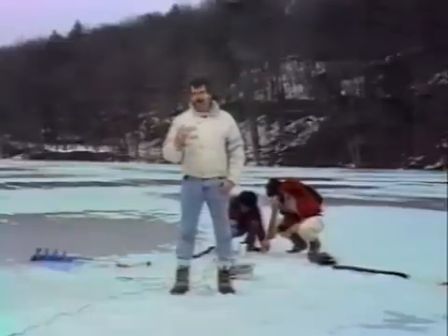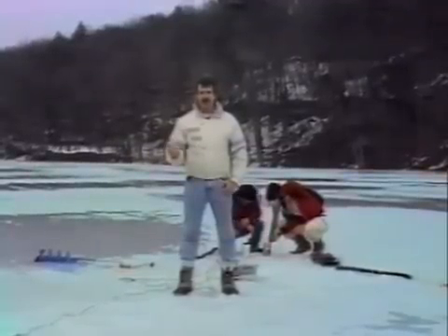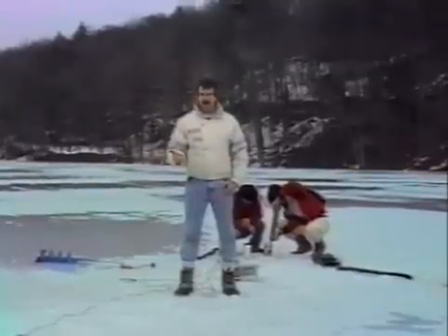Although this is usually done during the summer, it can be effective in the winter as well to find out what kind of production, balancing out with respiration, is occurring under ice.